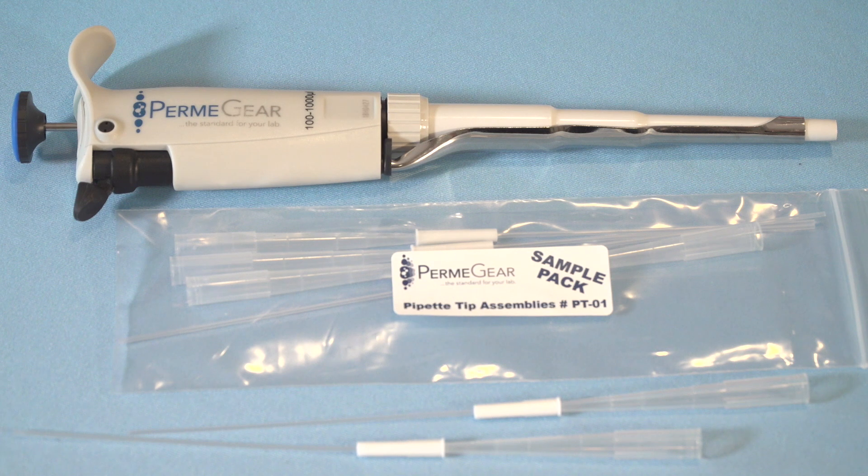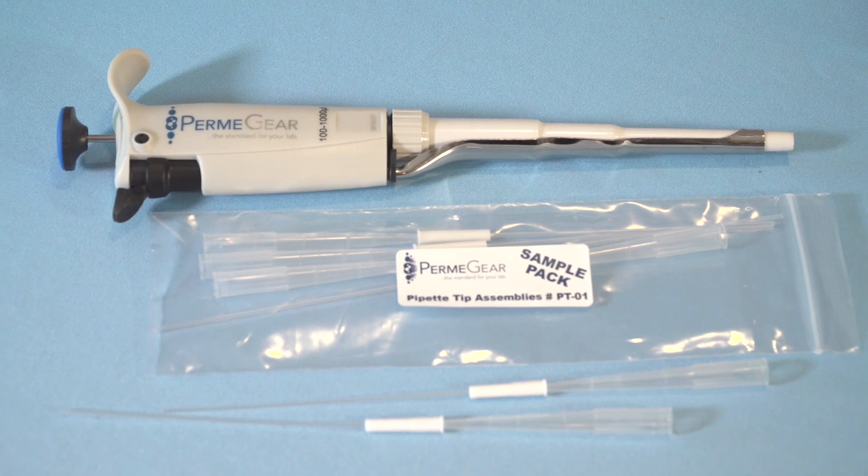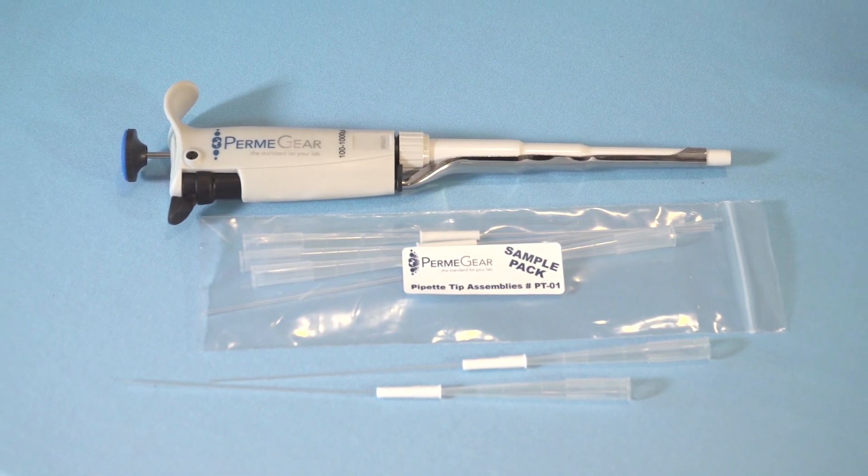If using a pipetter with a PermeGear pipette tip, it is recommended that an offset be applied to the pipetter to account for the additional resistance of the tip. Typically, this will be about 40 microliters.